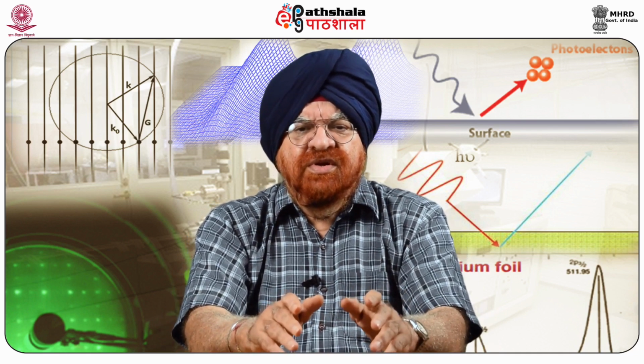A disadvantage of AFM compared with the scanning electron microscope is the single scan imaging size. The scanning speed of AFM is also a limitation. Traditionally, an AFM cannot scan images as fast as a scanning electron microscope can, requiring several minutes for a typical scan, while an SEM is capable of scanning in near real time, even though a relatively low quality can be obtained.